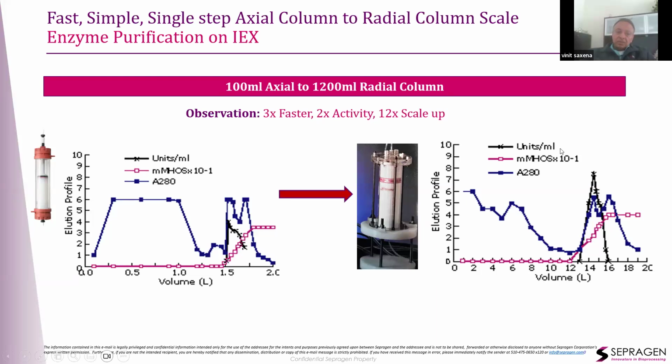So it turns out when they did the examination, the product was not stable, right? So it was getting chewed up. And so the faster you could get the product off the column, the higher the activity. They would never have known that had they just looked at their lab conventional data, that simply by speeding the process, they could get higher actual active product.